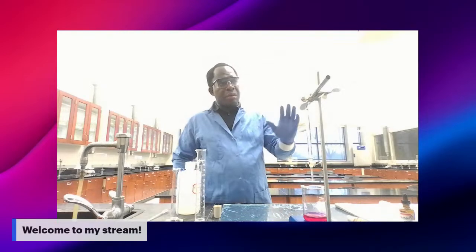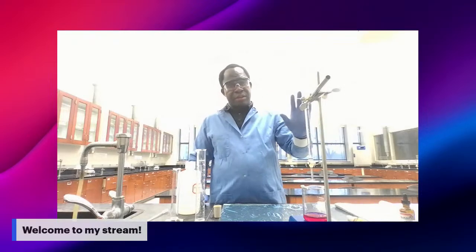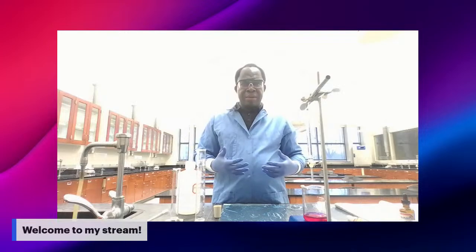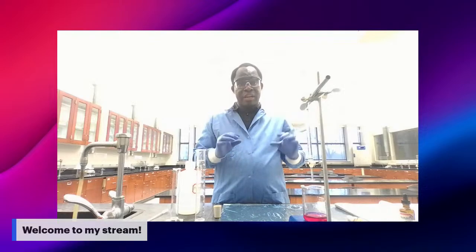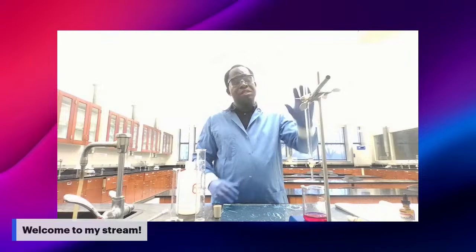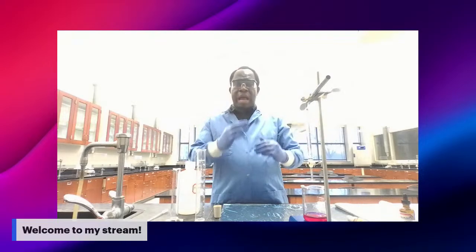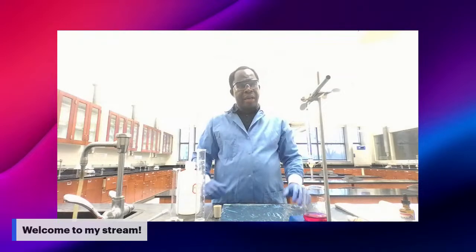Probably yours might be slightly different from what I'm getting here, so you don't have to question. This is a lab, an experiment you are running. We cannot all get the exact same value. So this is what I'm getting. You might get 23, you might get 20, depending on how accurate we are in this lab.